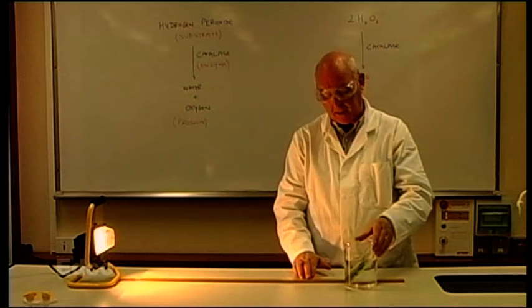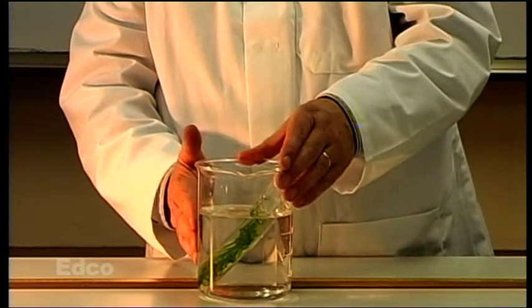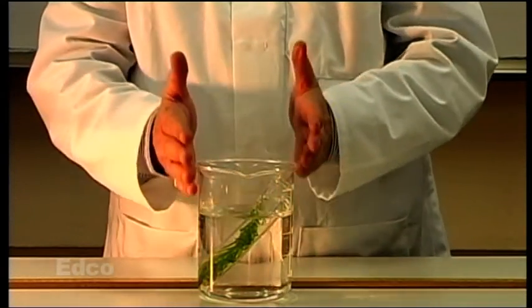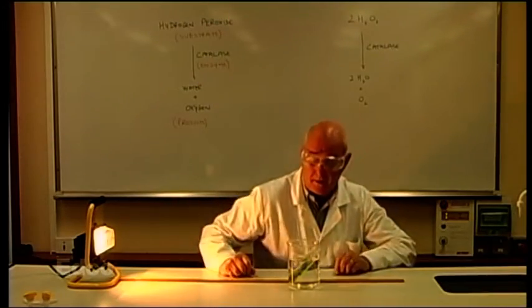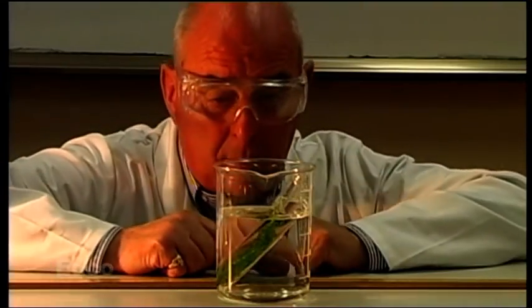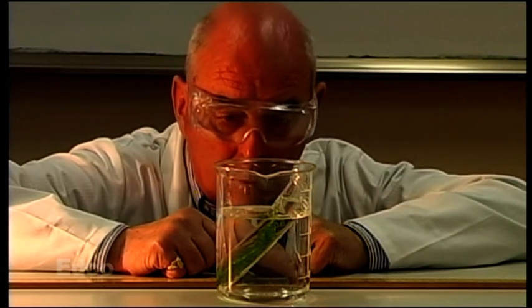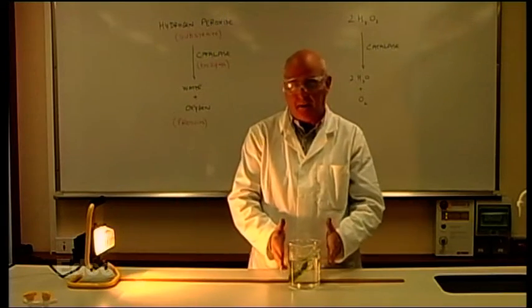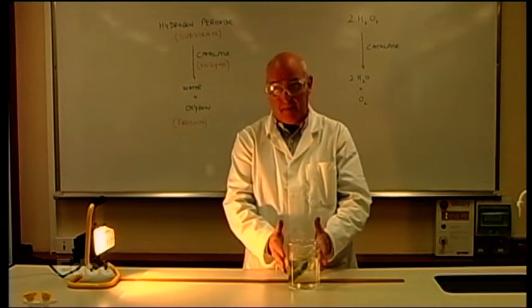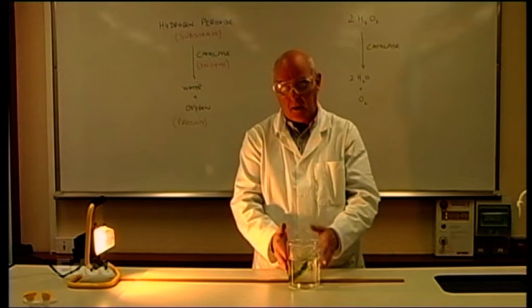We now move the apparatus in to the 60 centimeter mark, again lining up the front of the water bath with the 60 centimeter mark, and we leave it 2 minutes to stabilize. Having left it for 2 minutes, we again count the number of bubbles per minute 3 times and calculate the average. At 60 centimeters, the average number of bubbles was 18.